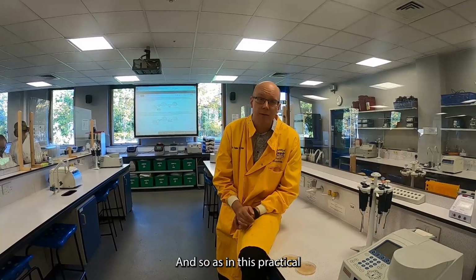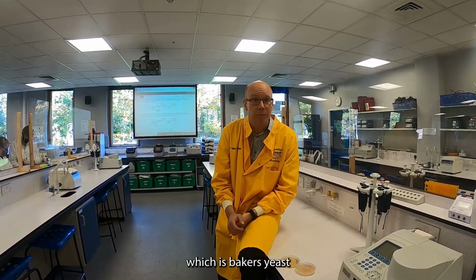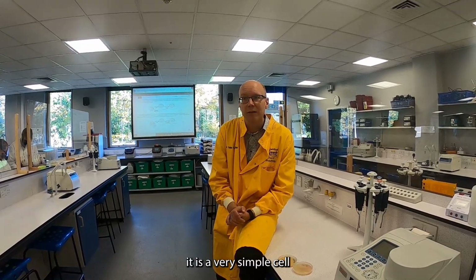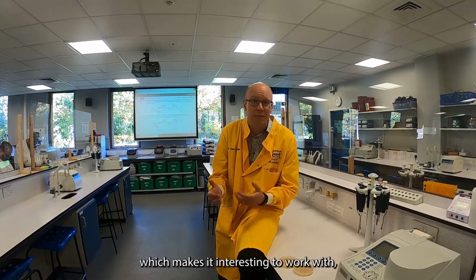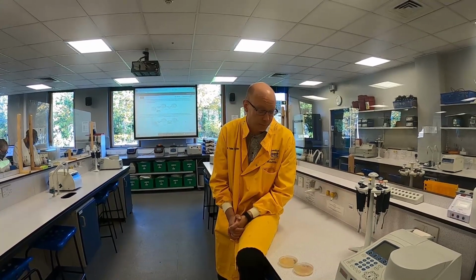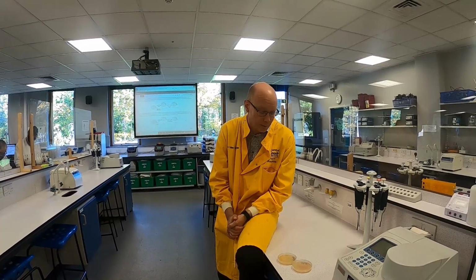And so in this practical, we're applying that to one of our lab models, which is baker's yeast. It's a very simple cell that's internally organized like our own cells are, which makes it interesting to work with. You'll know it because it's the same yeast used for baking and brewing.